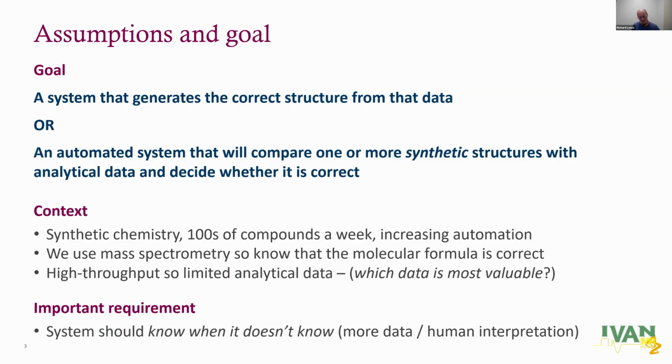Maybe they will one day. I think they're still quite a few years away from giving us something that will come up with a reliable structure. So in the meantime, while we're waiting for such a system, what we want is a system that will compare one or more synthetic structures with analytical data and decide whether it's correct.